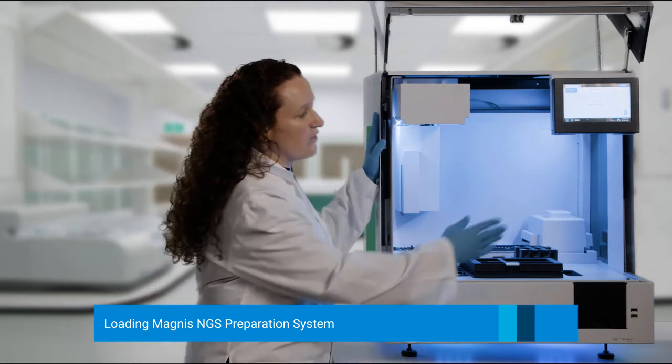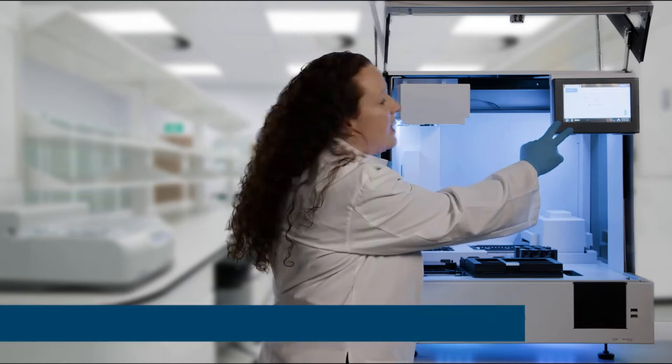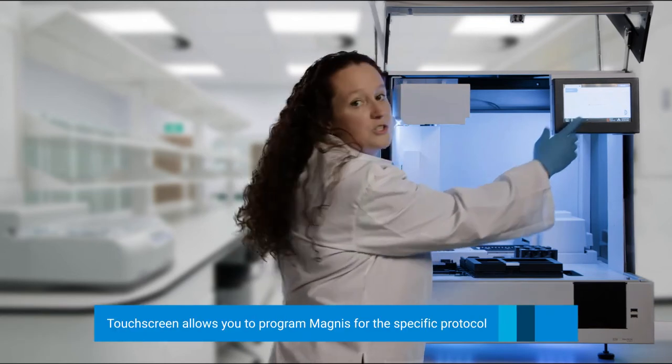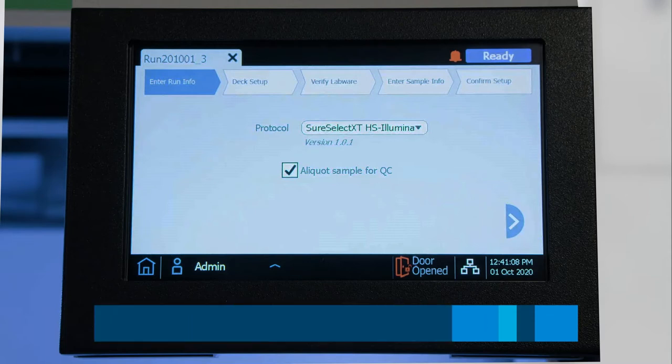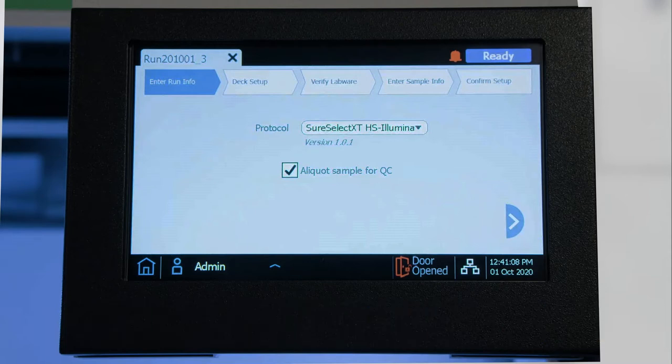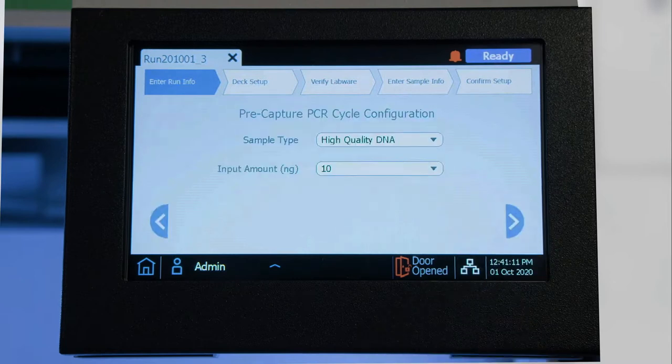This is our unit, and we've already selected to run from the touch screen. We are going to select the protocol — currently we're going to do SureSelect XTHS for Illumina, and we are also choosing the option to get an intermediate QC aliquot. We will click Next by clicking on the right arrow, and it will move to the next screen.